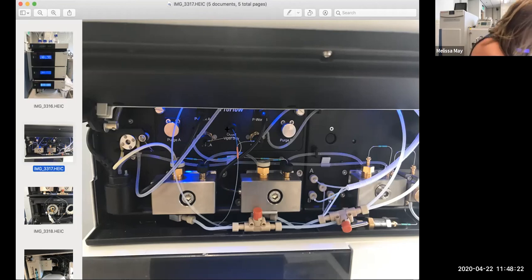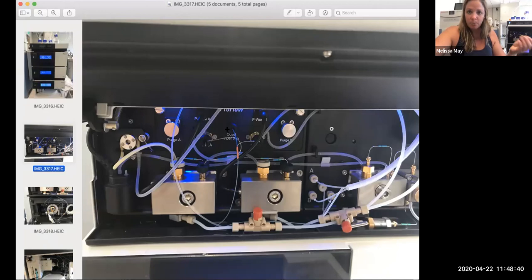If you're ever doing those auto tests, it will tell you that you cannot have your column or anything plugged up. And so there's also plugs, Viper plugs that look just like this, right? So it's a Viper plug, but there's nothing to come out of it that you'll put into that to actually block flow off. And then the back pressure building up helps to set the seals and pumps in these blocks.